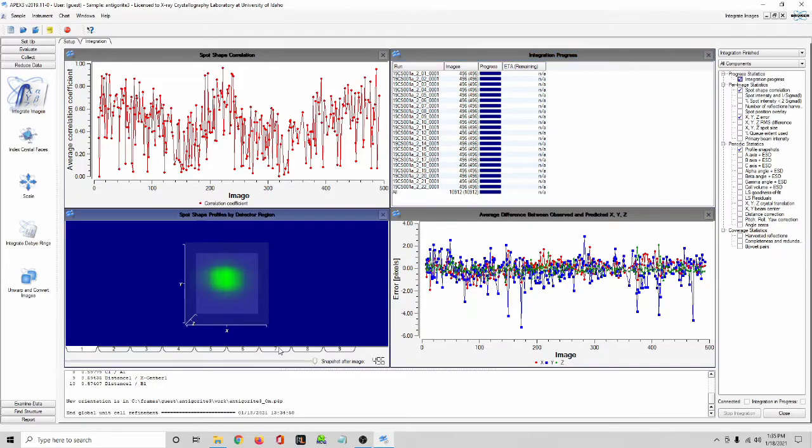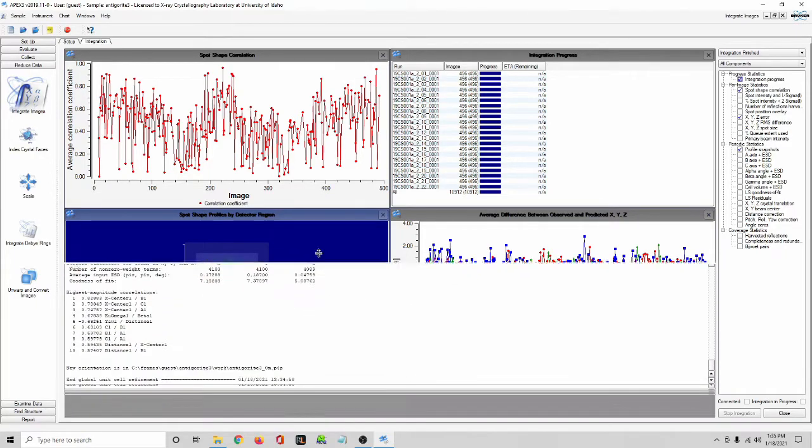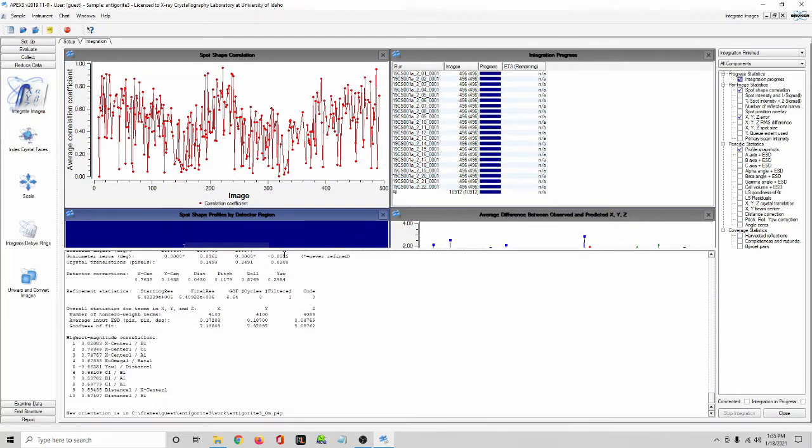Alright, so now that that's done, a few notes about the collection, and about why I picked this crystal. As you saw, the spot shapes weren't the best. That can often be the case, in this case it's a sheet silicate with disorder and twinning, and there's going to be issues with that. But that part isn't so important if it's finding the lattice, which it clearly did.